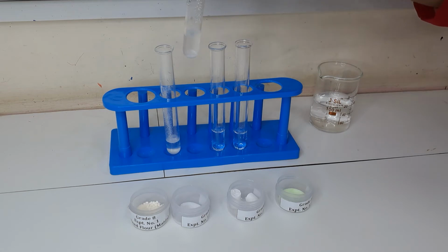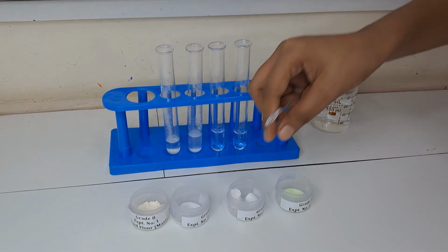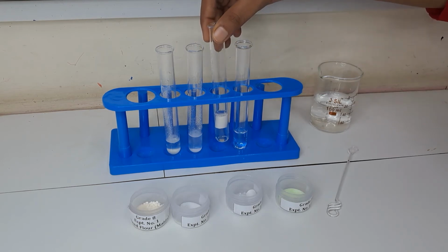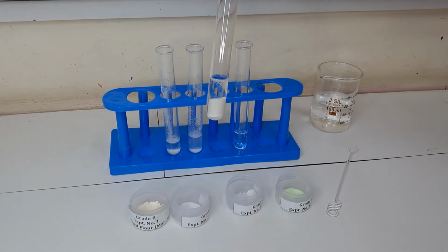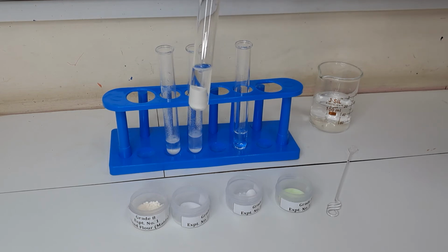Now in the third test tube, you have to add chalk. One piece of chalk you have to add in it and observe. Once you have added the chalk, you will get some sound. So you have to check the sound. You can check whether bubbles are appearing or not. So you have to observe again using your sense organs. You have to observe very carefully.